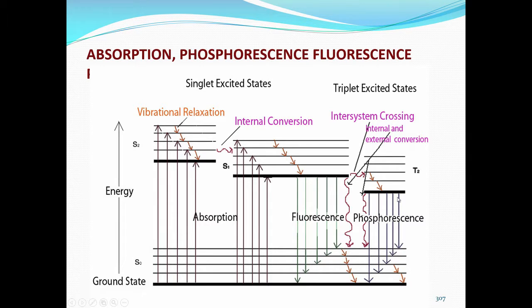So, obviously, this is known as a metastable state, and also there are a lot of intersystem crossings, and the absorbed molecules may lose the energy to other solvent molecules and their own molecules by collision and other things. But still basically the fluorescence, phosphorescence and absorbance phenomena are represented like this, and it is easy for us to understand how these processes take place.